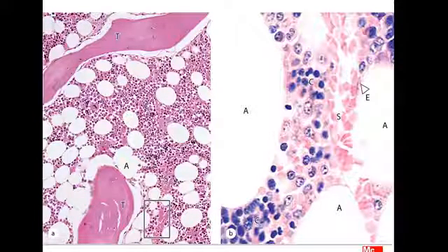and the bone marrow consists of another part, which is adipose tissue. This is the adipose tissue that consists of adipose cells. Round cells have a fat vacuole that occupies most of the volume of the cell, and have a peripheral nucleus. This is the first part. And bone marrow consists of hemopoietic tissue and adipose tissue. The bone marrow is located in the bone marrow cavity. This is the cavity of the bone marrow, and this is the trabeculae of bony material.